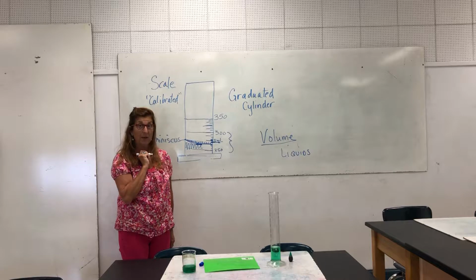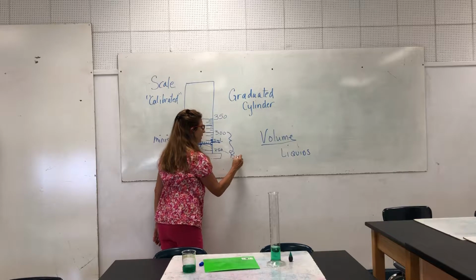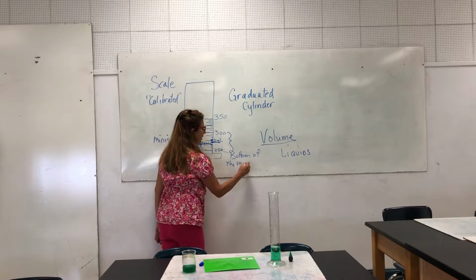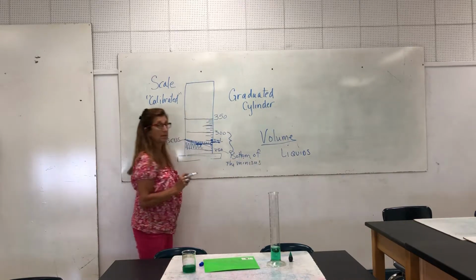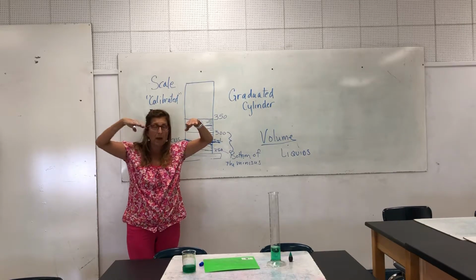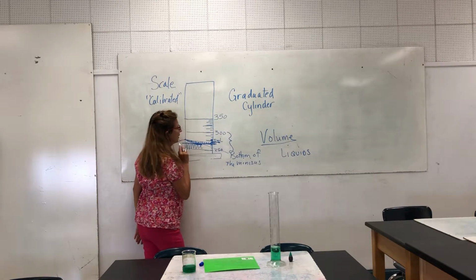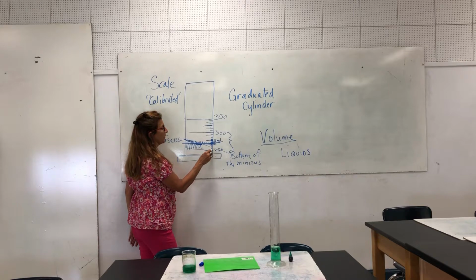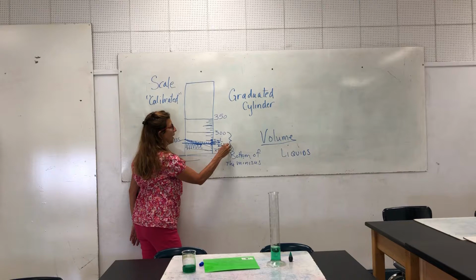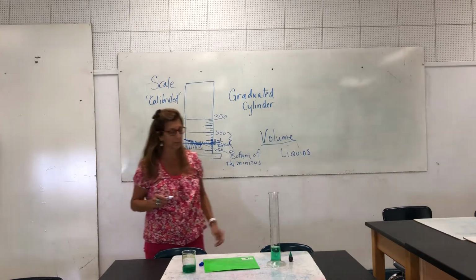Well, maybe you got it right. The correct way to read the cylinder is always going to be the bottom of the meniscus. Not the sides where the water is drawn up or the liquid is drawn up. At the very bottom, where the bottom of the little belly is, would be the exact place that you would read the cylinder. So in this particular example, 255, 60, 65, we would have 265 milliliters of fluid. We would not have 270 milliliters of fluid.